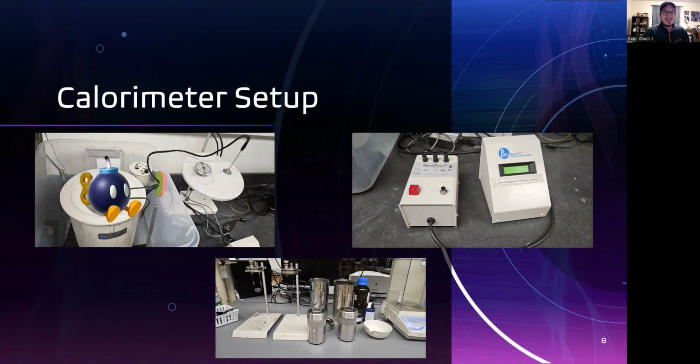When working with cyclohexane, it's also important to note that it's really volatile, so it must be put into a capsule and then placed into the basket of the calorimeter. For CDDT, it is less volatile, and the liquid chemical can be placed directly into the basket. When this is done, the next step is to cut a length of wire to be our fuse, approximately 10 centimeters. This fuse was then placed above the basket, with the wire just touching the sample and careful not to touch the outside metal of the basket.